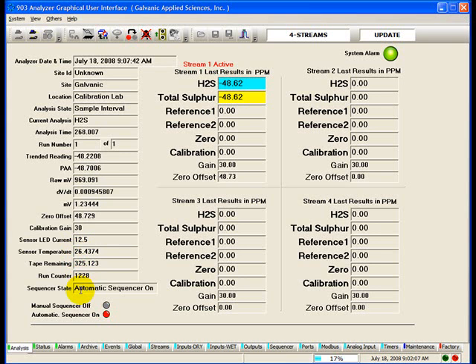This tab screen could show up to 4 stream sections, giving the operator the last or current results on any stream activity. The field that is highlighted in yellow is the next operation to be executed in the queue. The blue highlighted field is an operation currently in progress.